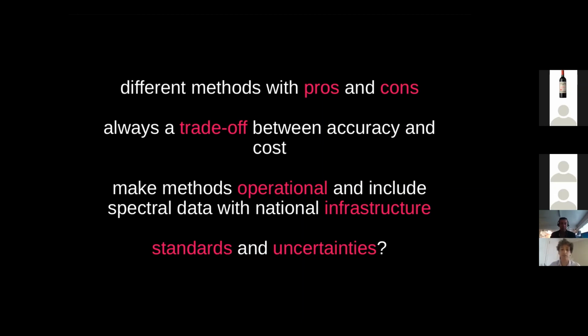As an example, we are part of a ring test where different samples from the US have been sent all over the world to different soil spectroscopy labs, so that we can compare the performance of scanning basically the same soils across a variety of instruments. And that's me. Thank you very much.